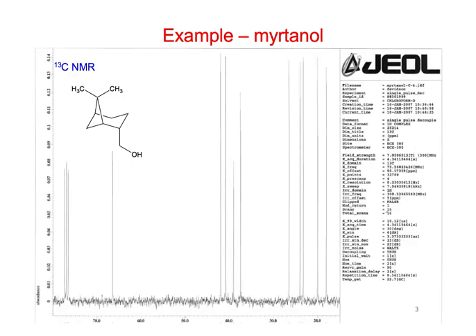Okay, so here's the C13 NMR. Of course, there's no aromatics or anything. This is the solvent. Which one is solvent? The three peaks, the middle? All three of those.